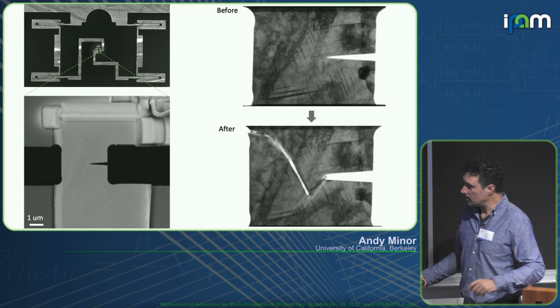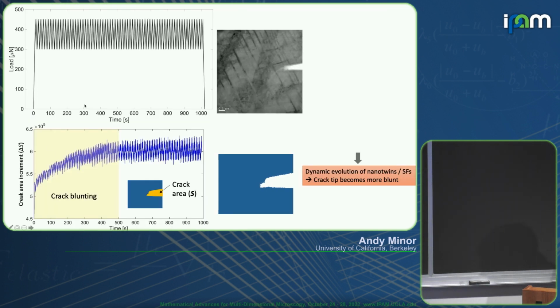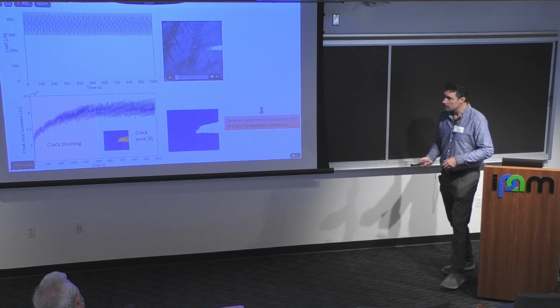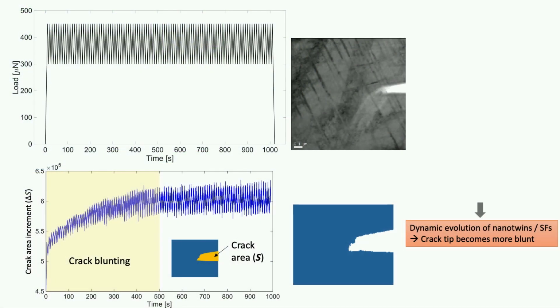And what you see in the deformation, I thought I had a movie. Oh, a little out of order, sorry. Here's the movie. Well, you can't see it here, but what you see is more stacking faults coming in, this network increasing.